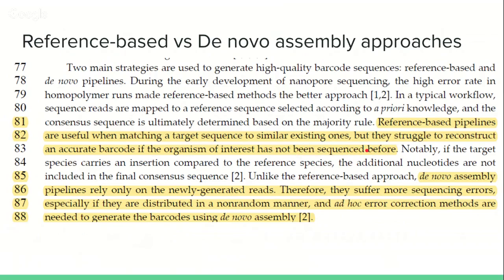So, for example, in the era of next-generation sequencing, if you want to align reads produced by a next-generation sequencing platform to the human genome, you just have to download a copy of GRCh38, for example, and that copy is a reference of the human genome that's complete enough that you'll get most of, if not close to all, the information that you need.